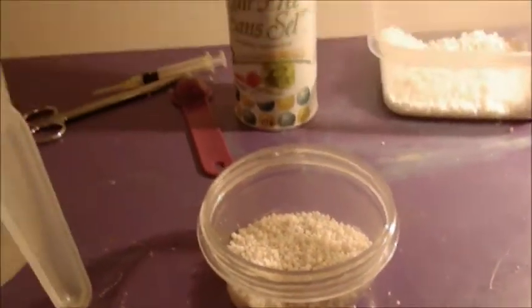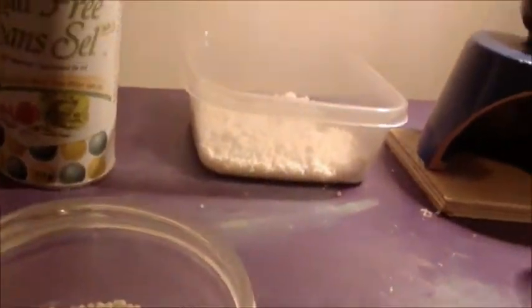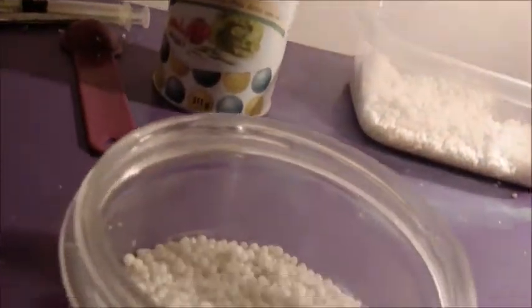Hey YouTube, today I'm going to be making potassium nitrate from ammonium nitrate, which is found in coal packs, and potassium chloride, which is in salt-free salt or sodium-free salt.